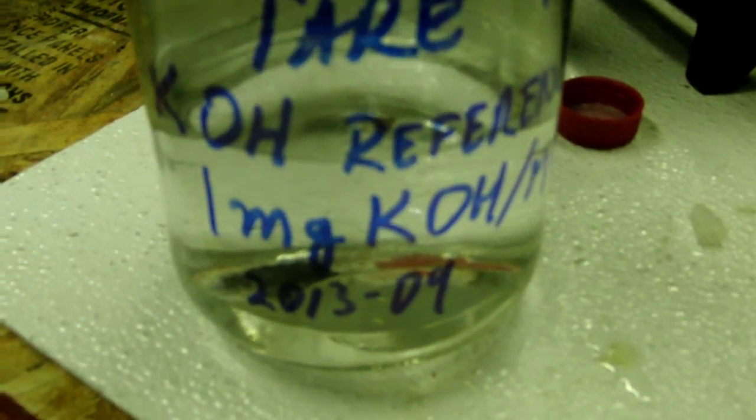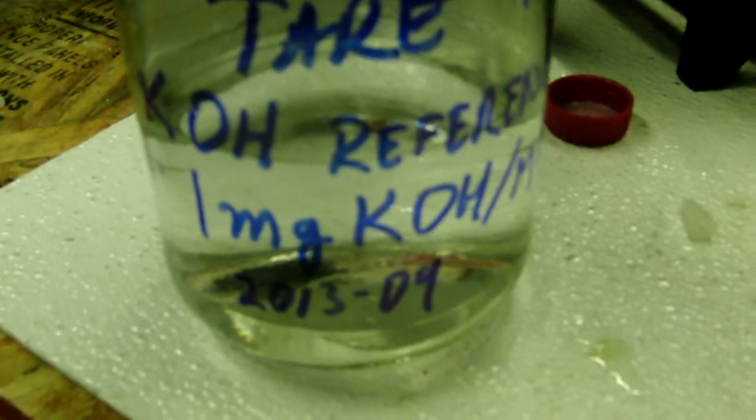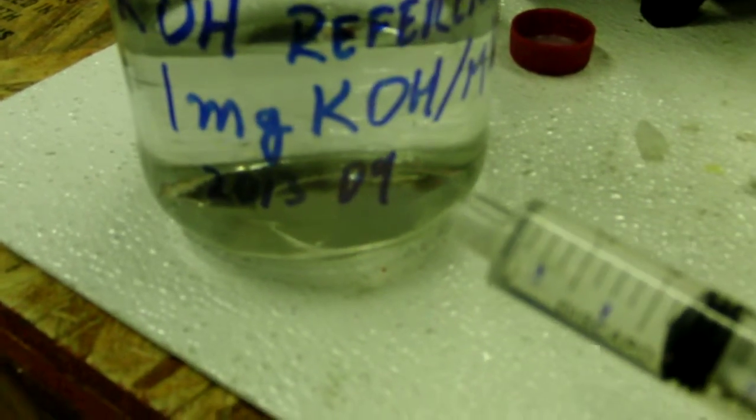Okay, doing a titration. I have a reference solution with one milligram per milliliter of potassium hydroxide. I've got an indicator made with curry.